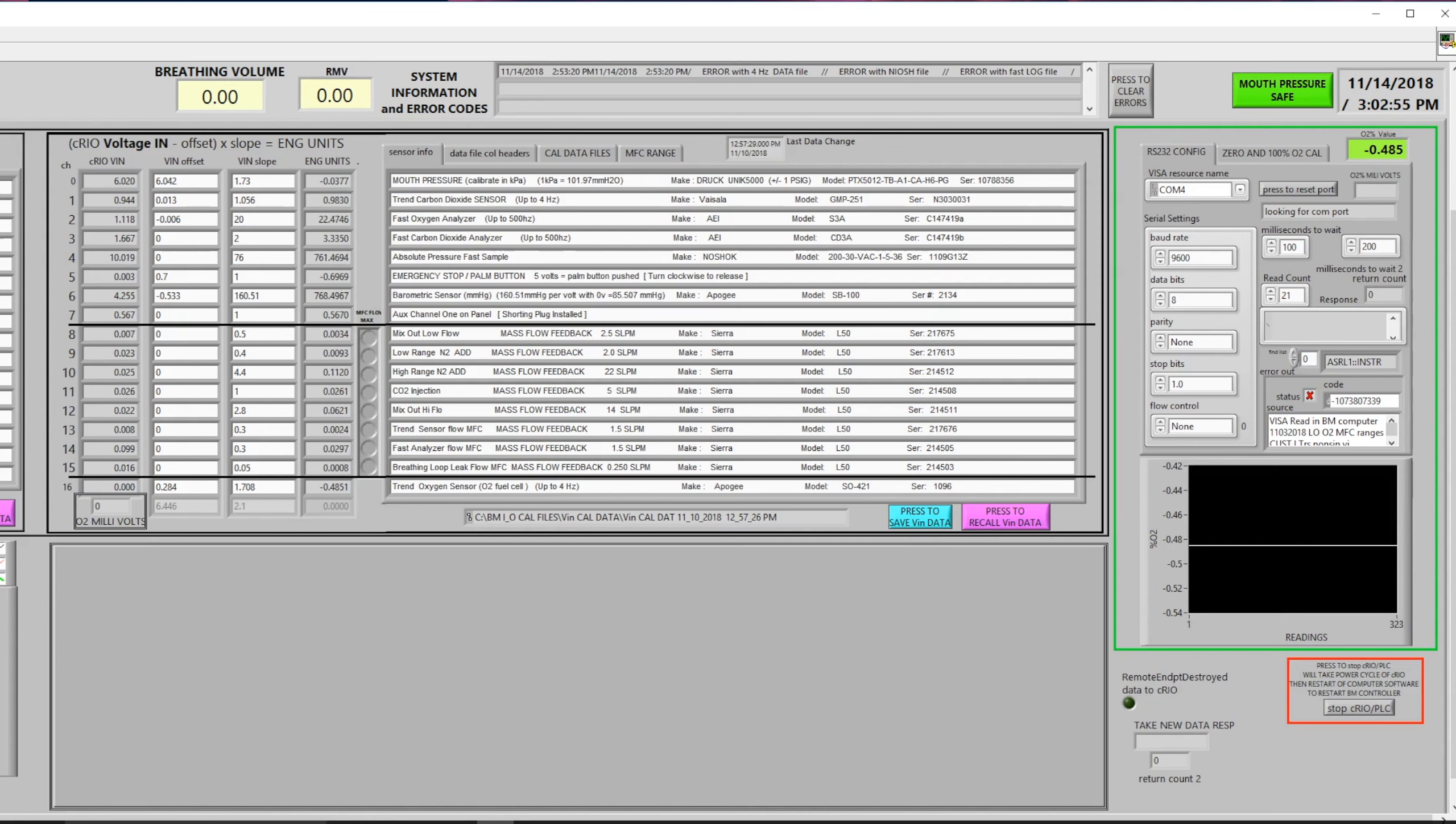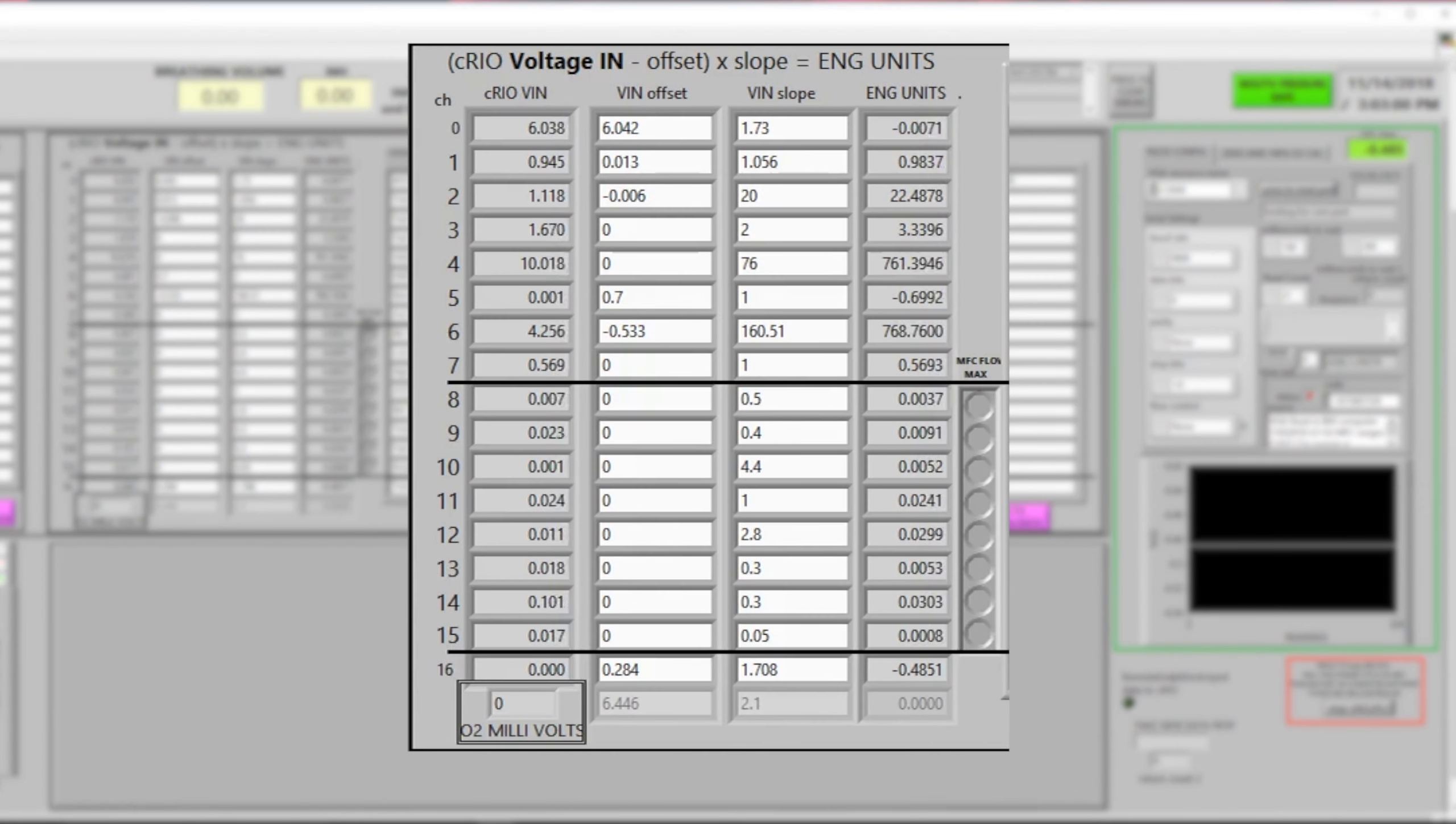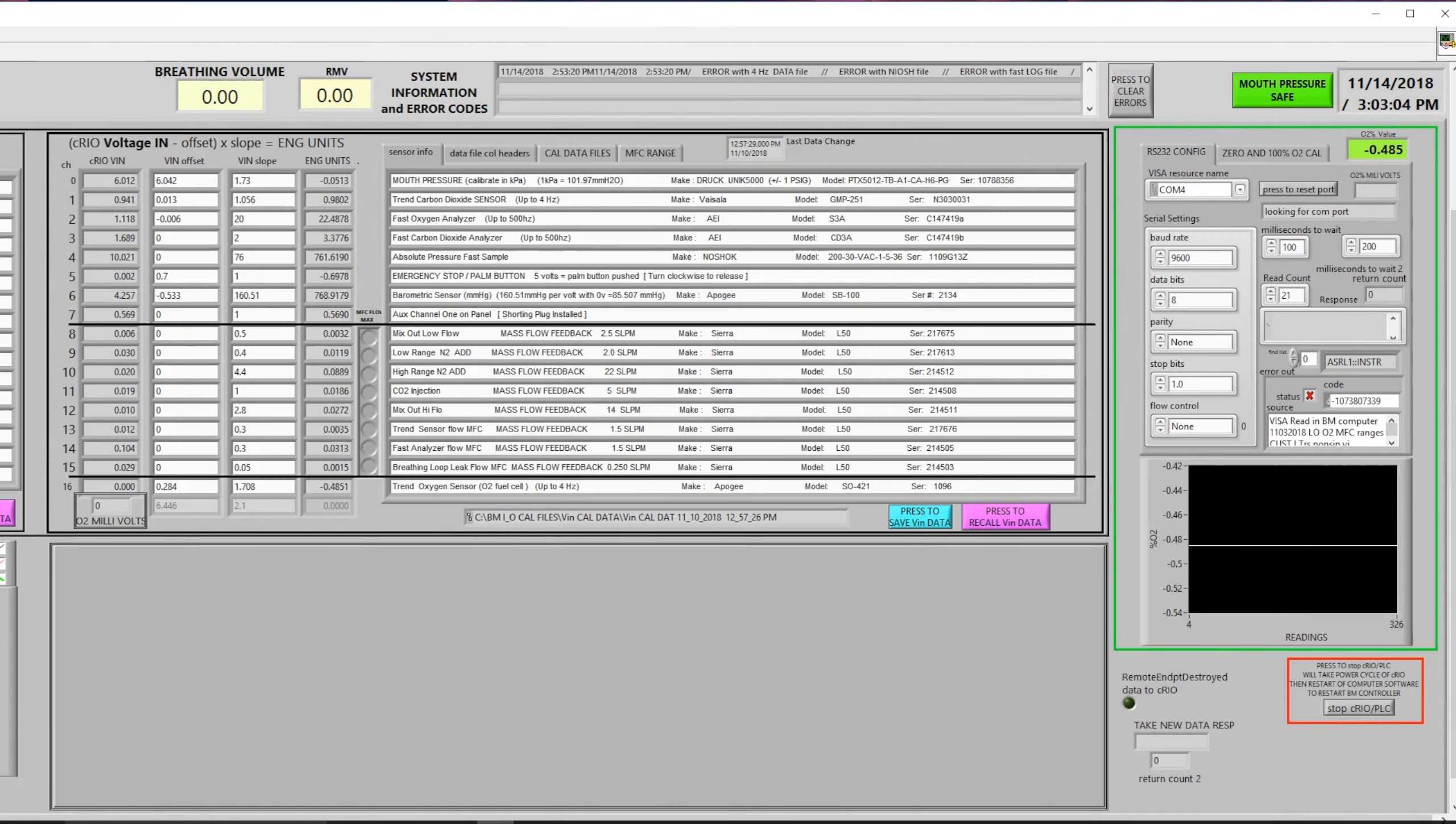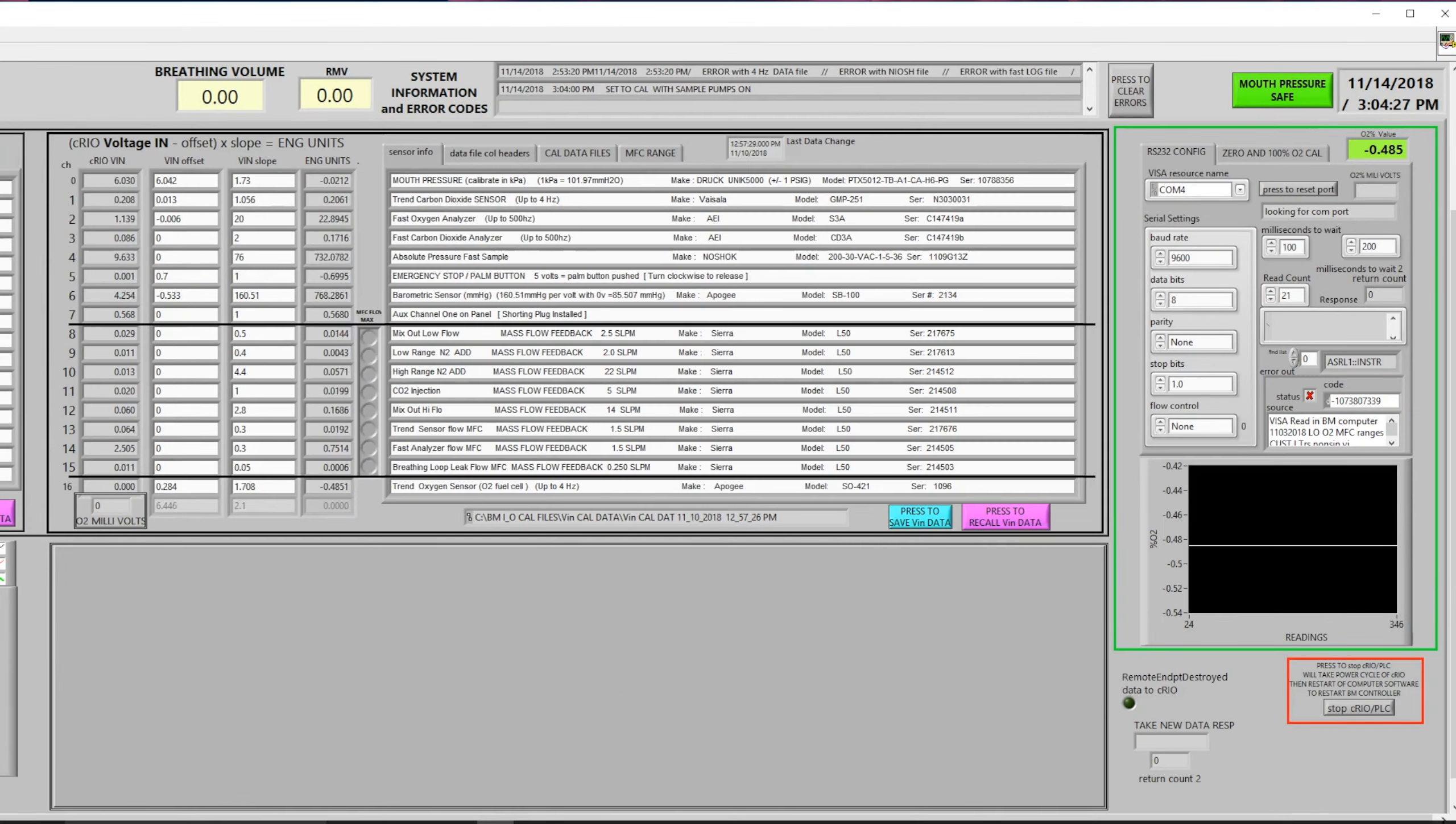The slope and intercept values for all of the equipment on board is given here in the calibration screen. Also located on this screen are the serial numbers and model numbers of the equipment used within the system.